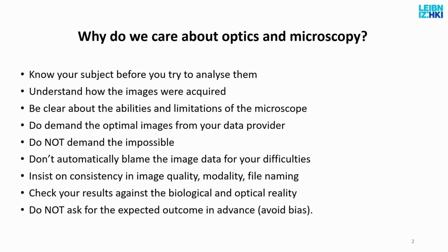And you will also learn in these 3 hours how you can improve things so you don't have to be optimal all the time. You can compromise, but it's also important to know where you can compromise, where you should compromise, depending on what you want to get out of your imaging data. So it's not programming, it's not image analysis, but it's a basis for image analysis. And here you just see a list of points that we have experienced in many years that we have been doing this kind of job that I briefly summarized earlier.